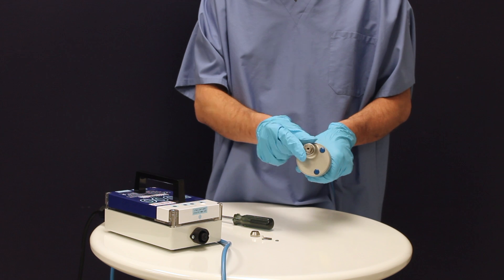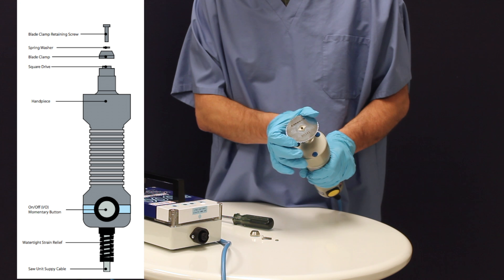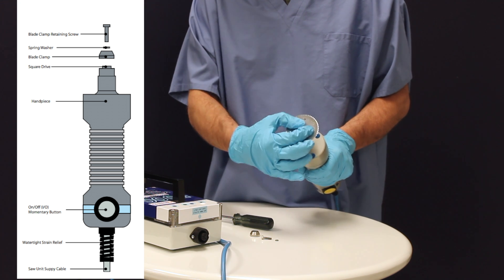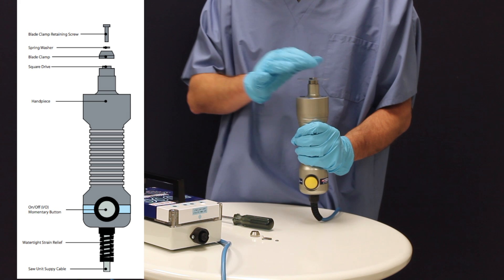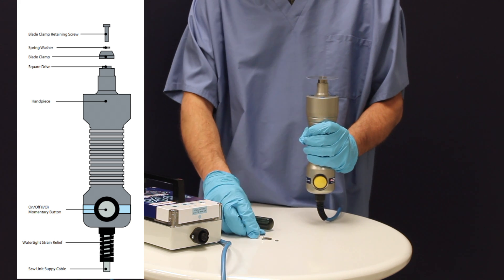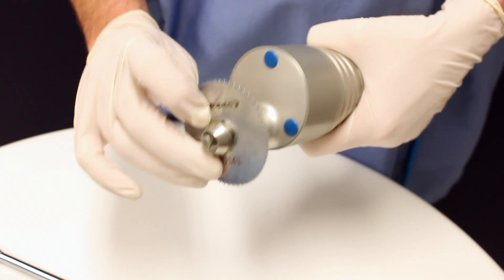When replacing the blades, make sure the middle of the blade fits against the square drive. Lay the blade flat on the arbor by holding the saw perpendicular. This will prevent the blade from slipping.